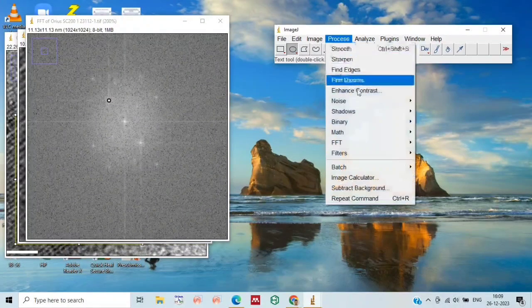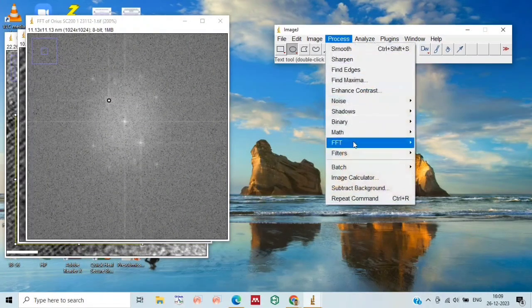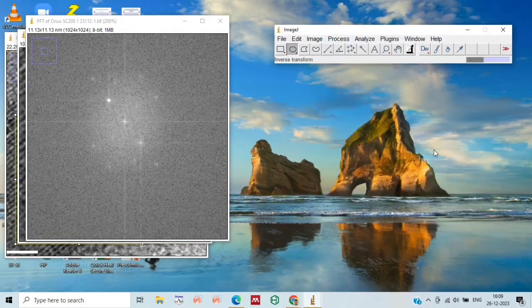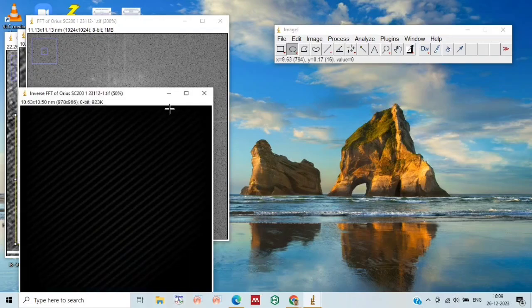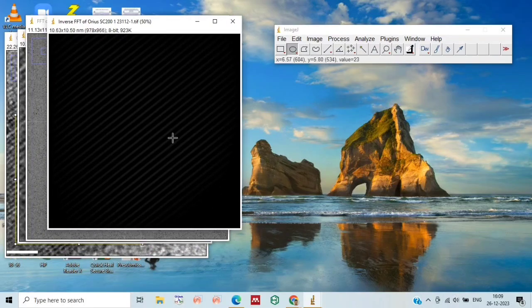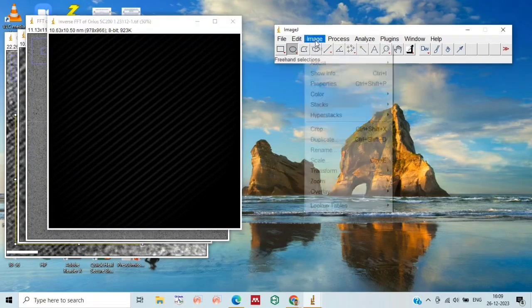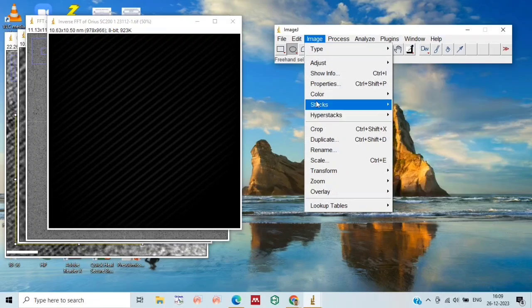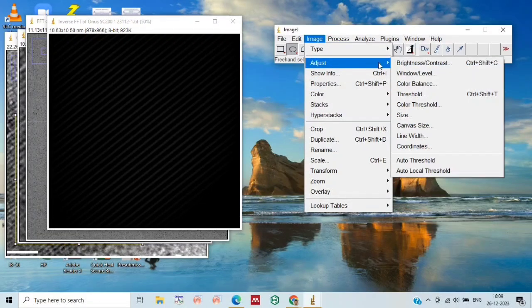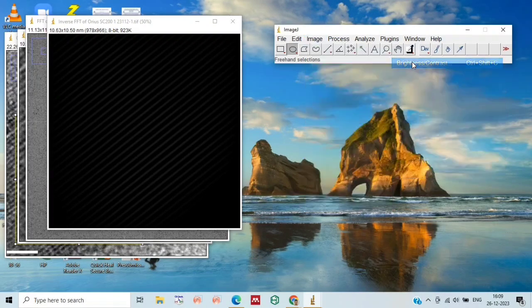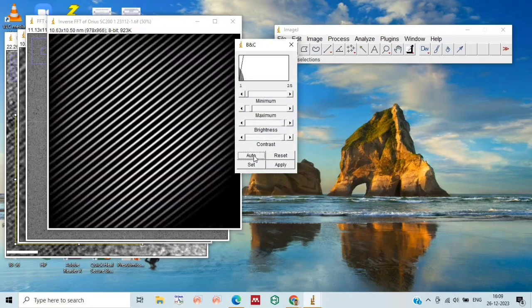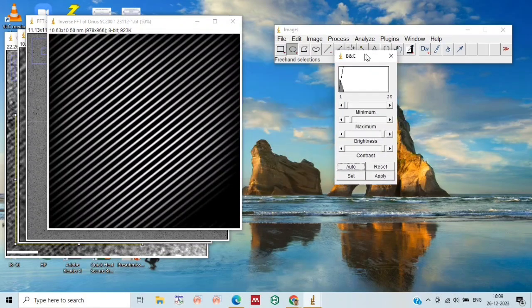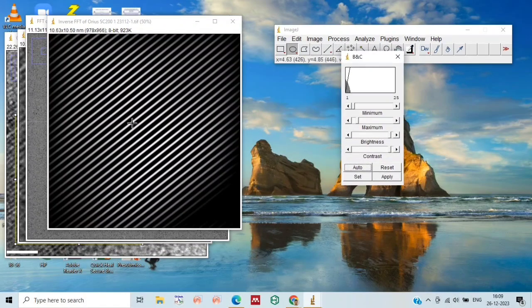Then perform the inverse FFT, so we will get this new window. Now go to Image and adjust the brightness and contrast, so we will get these clear lines of d-spacing.